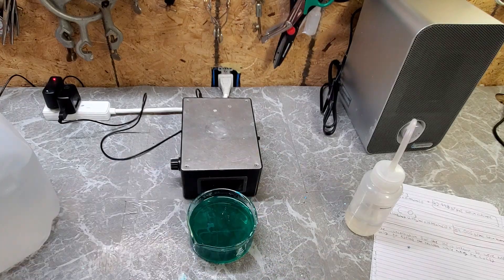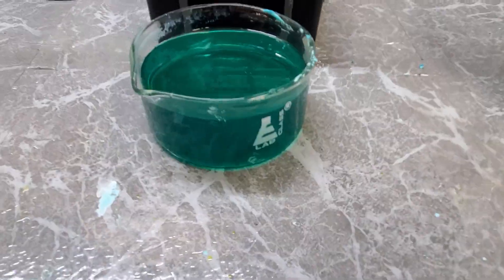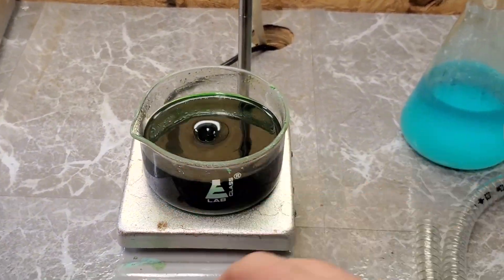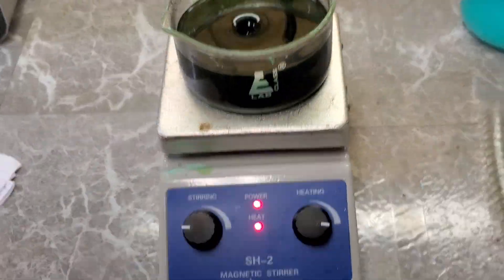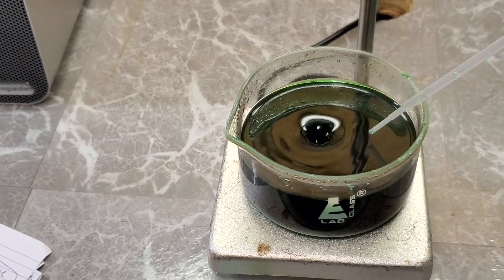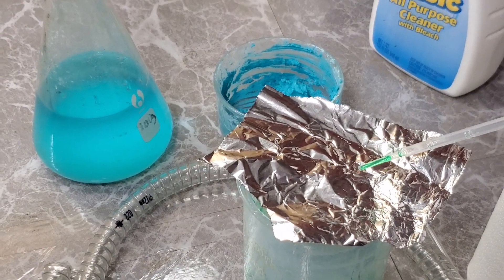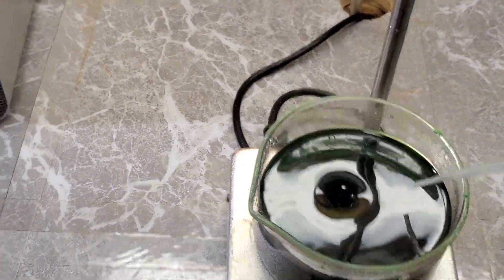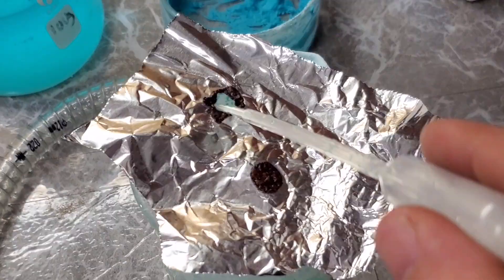Hydrochloric acid reacts with copper carbonate to produce our desired copper chloride, water, and more carbon dioxide. After allowing the solution to sit for a while, you can see it has turned a beautiful deep green color. And just for fun, let's add a few drops of copper chloride onto a piece of aluminum foil. The two react in a single displacement reaction yielding copper metal and aluminum chloride. Hydrogen gas and a generous amount of heat is also produced.